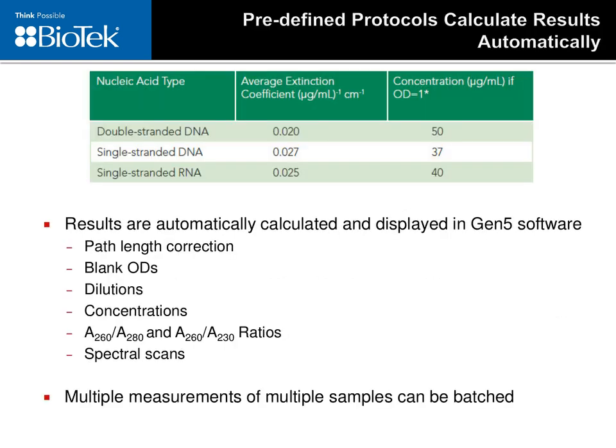So as I just mentioned, the automated methods can be applied to other nucleic acids and can be combined with several other measurements to provide additional information. For instance, it's common to simultaneously perform absorbance measurements at 260 and 230 nanometers and/or perform spectral scanning measurements to gain additional insight into sample purity prior to performing downstream applications.